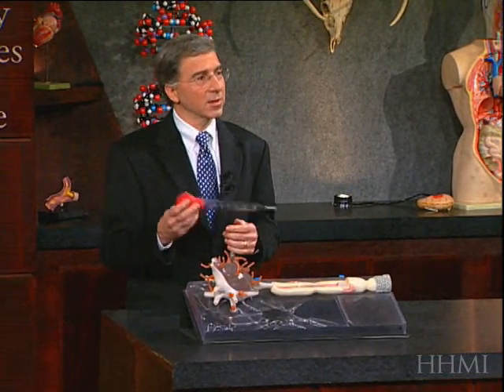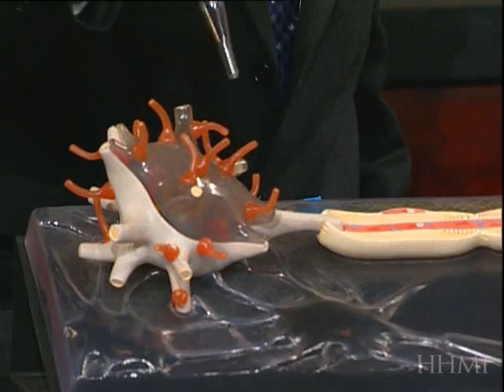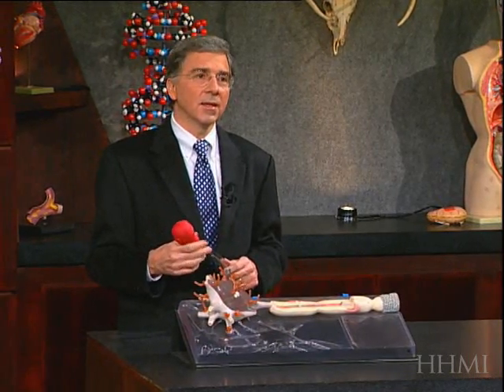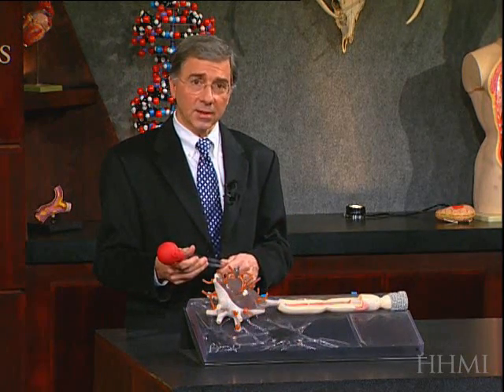...we would extract the nucleic acid, which I'm going to do here with this turkey baster since we've just finished Thanksgiving. So you'd suck out the nucleic acid, extract it from the cell, and then using the part of the nucleic acid called RNA — which represents the genes which have been expressed or turned on — one can make a probe from that and label the probe with a fluorescent marker.